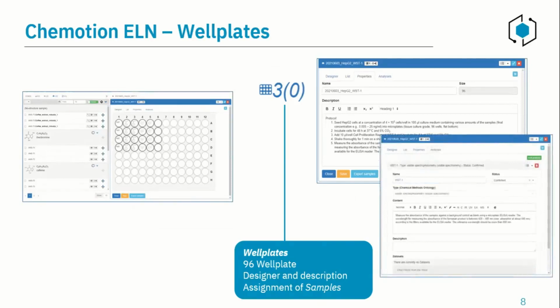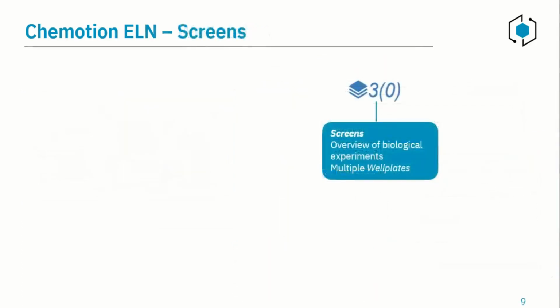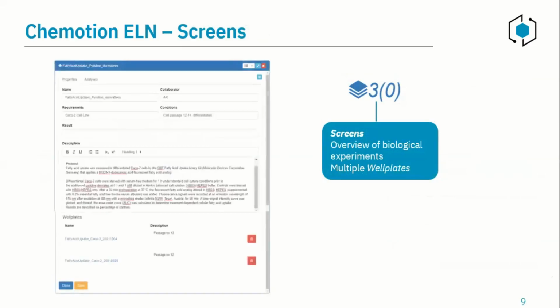And if you're doing multiple well plates, you can use the screens function as some kind of assay of multiple well plates. You can drag and drop them also into this screen as some overall experiment over all your well plates that are connected to each other.